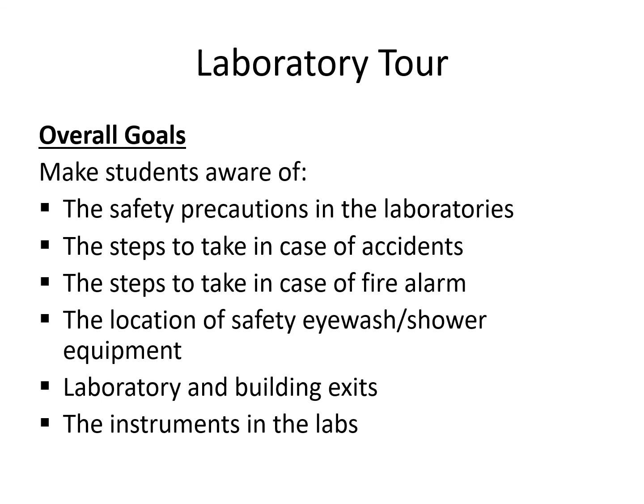But in terms of the instruments in the lab and the safety, generally as undergraduates and non-chemistry majors, you won't be handling most of those on your own. You'll always be supervised. And the more dangerous ones, or in the reality of life, the more expensive ones, the TA will be doing it for you, and he'll let you press the buttons, but he'll be there with you at all times, so nothing gets screwed up. So instrumentation is a big deal, and you need to know where those are and what to do with them. But you won't be doing very much with that this semester, other than just a quick question: does our lab have a safety shower? Does our lab have eyewash stations? That type of question is all you're going to be getting.